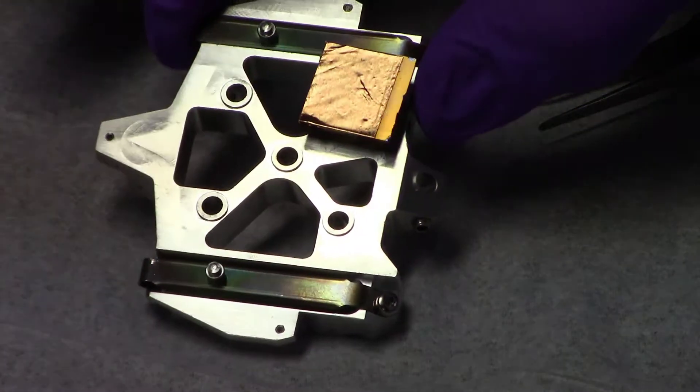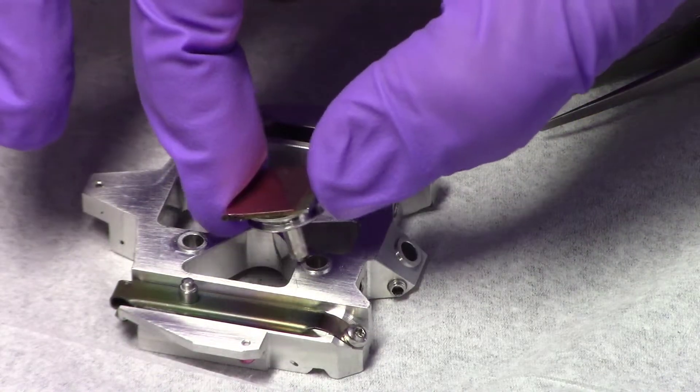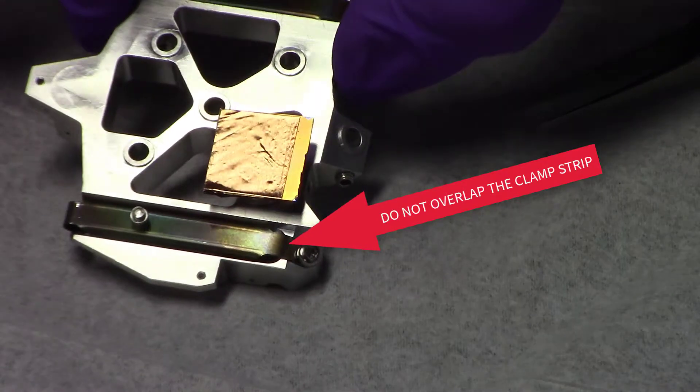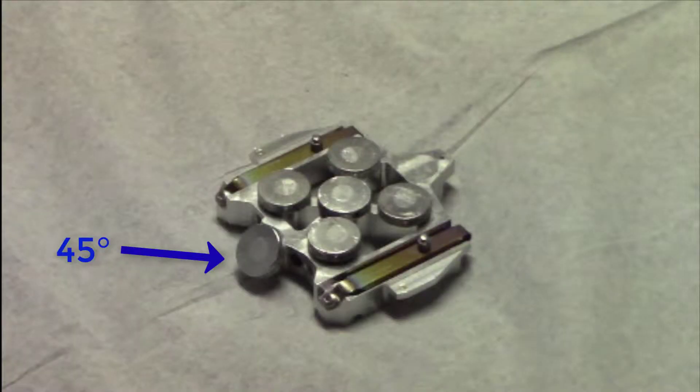Next, you will want to consider the placement of your samples in the shuttle, making sure not to overlap where the shuttle clamps. You can load up to 6 samples at a time, including the 45-degree position.